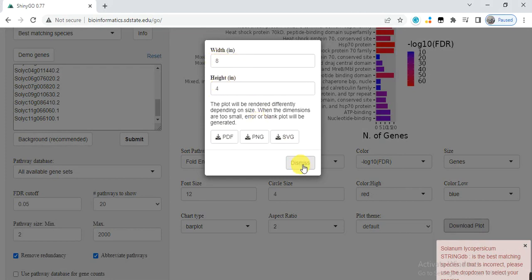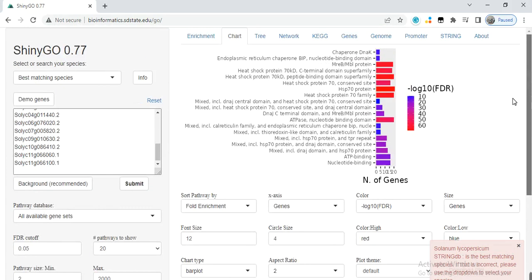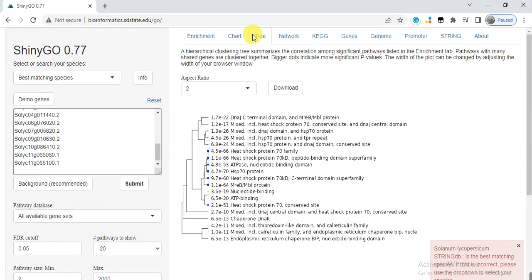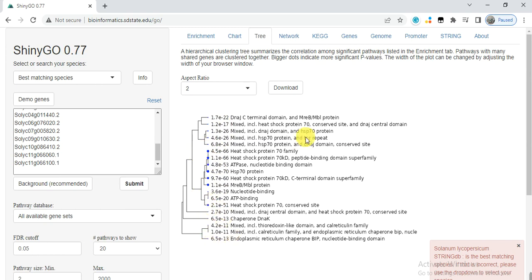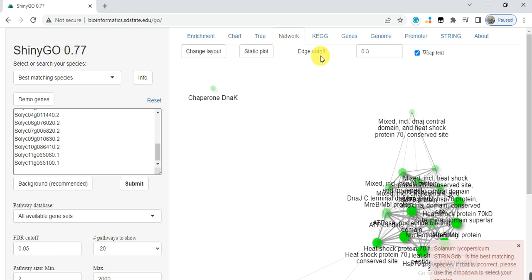The next one is tree. It will make the tree and distribute those family genes into different groups. You can also download this figure.